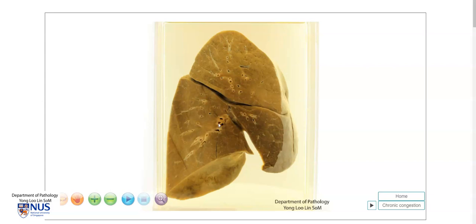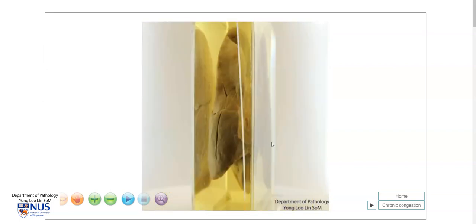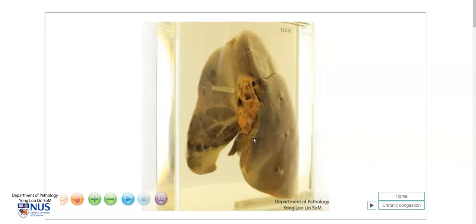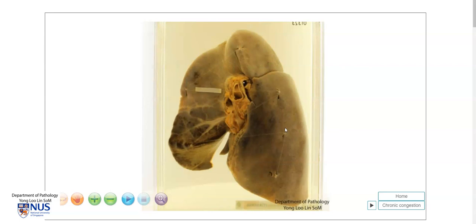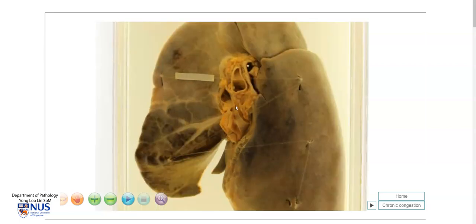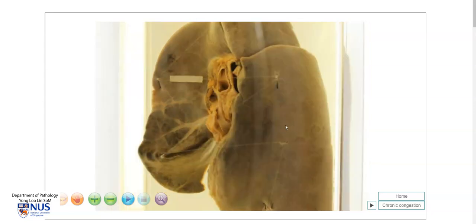Hello, this is a virtual pathology specimen of the right lung and we can see the three lobes here and this shows the cut surface. Let me just rotate it and we can see that the pleura is very smooth — the visceral pleura — and there are some large vessels as well as airways here.